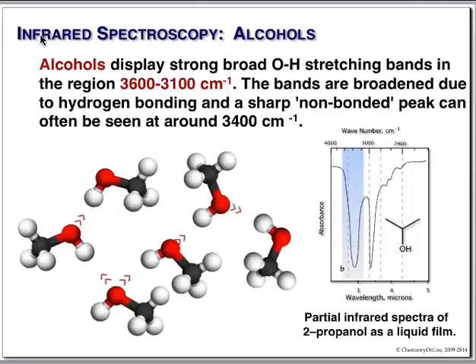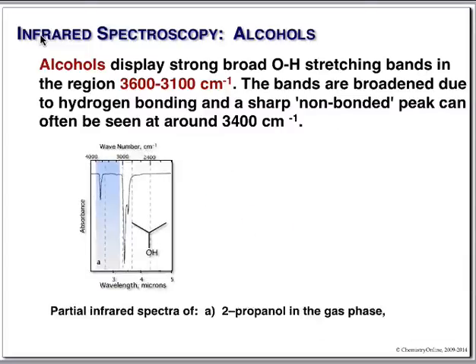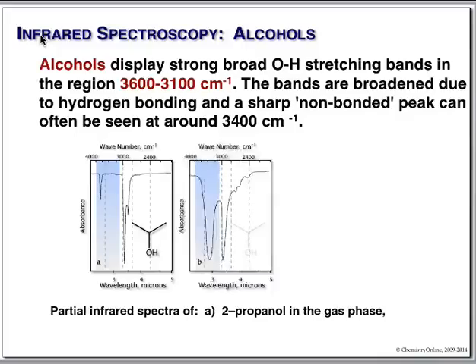Now, you can actually see a real OH stretch if you go and look in the gas phase. This is 2-propanol in the gas phase. In the gas phase, we have a very clean, very sharp OH stretch. This looks like about 3650 or something like that. In the gas phase, you don't have hydrogen bonding. When we do have hydrogen bonding, again, remember, we get lots and lots of different ones, so it broadens way out.